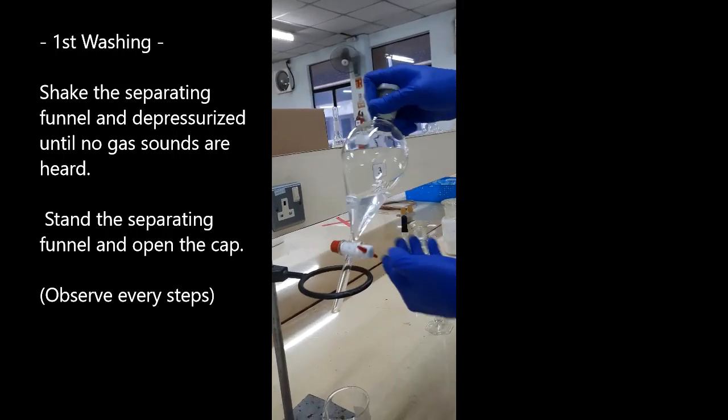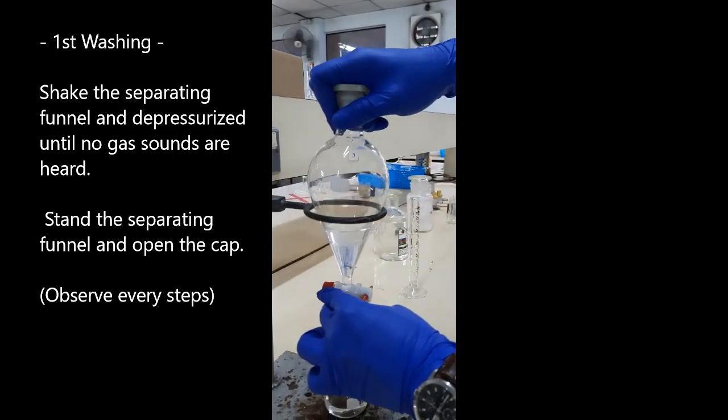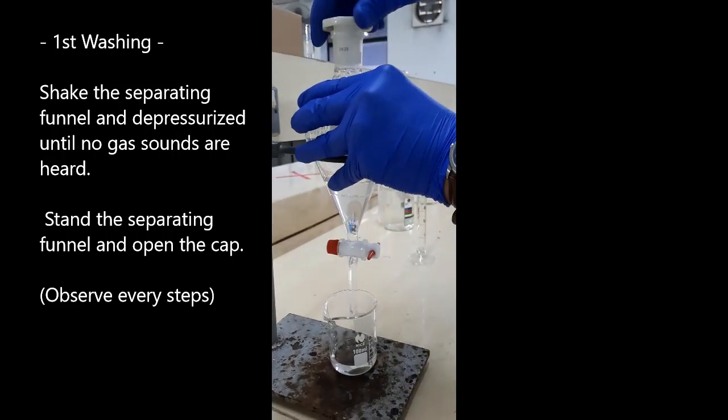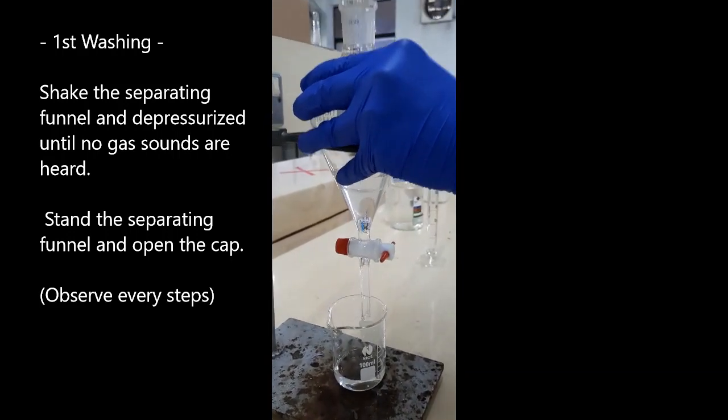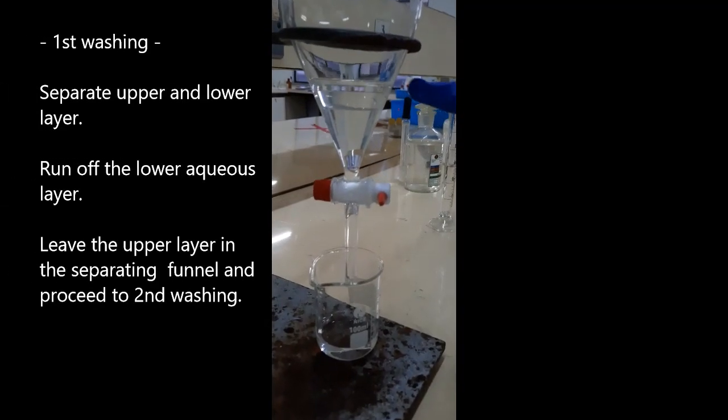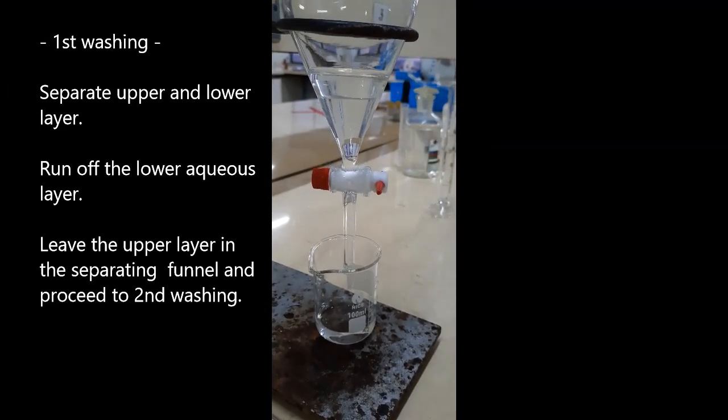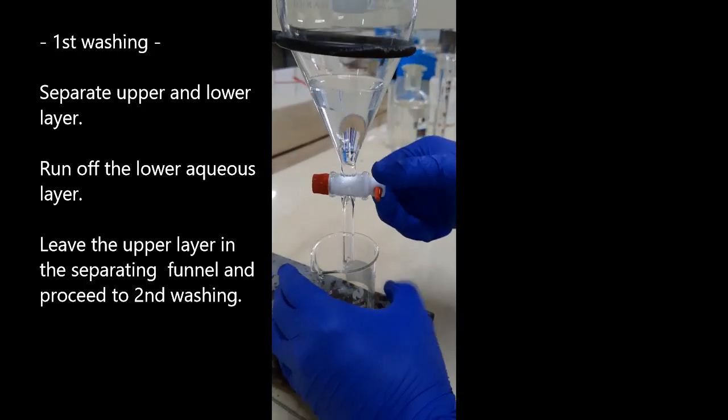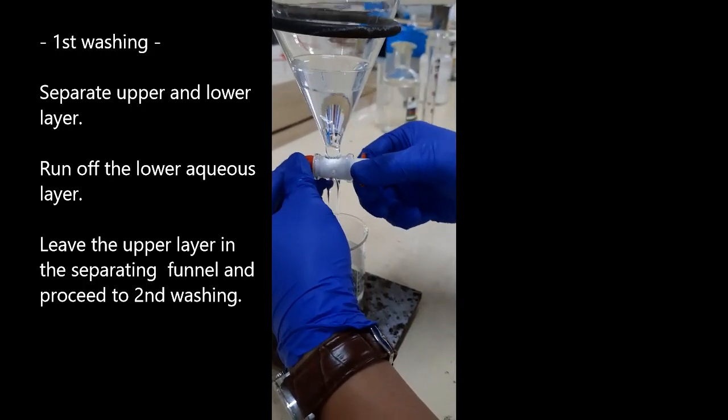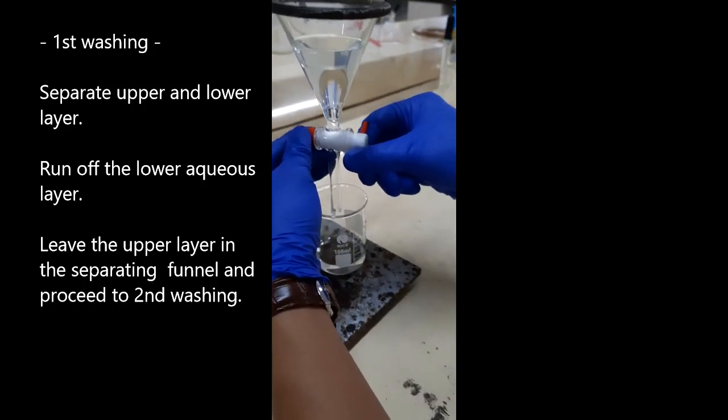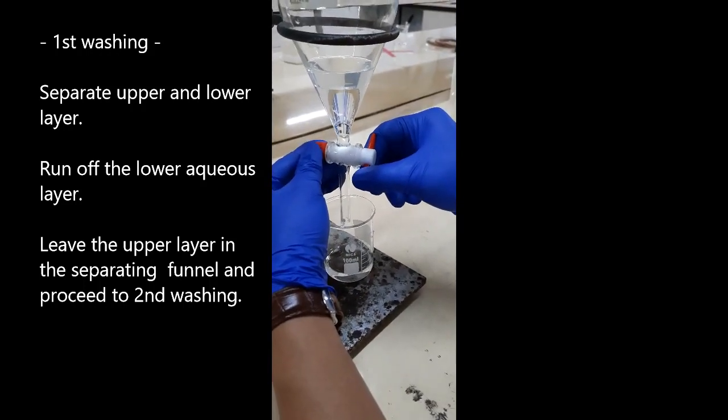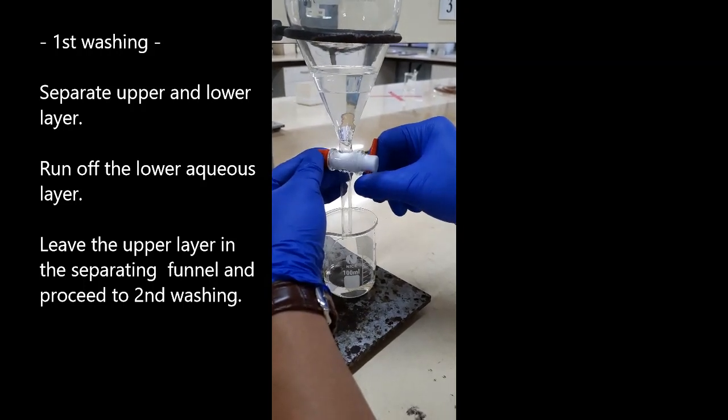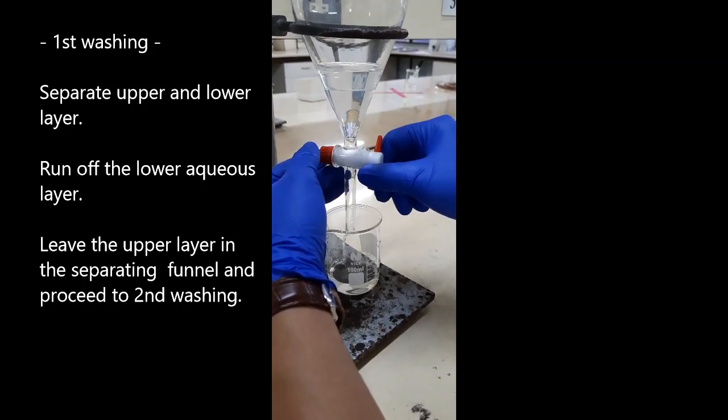Let the separating funnel stand for a while. Before opening the cap, observe the two liquid layers form. Run off the lower aqueous layer. Leave the upper layer in the separating funnel and proceed to the next step.